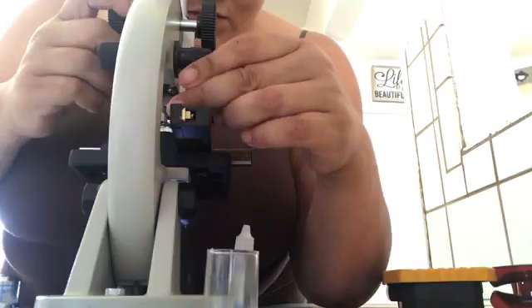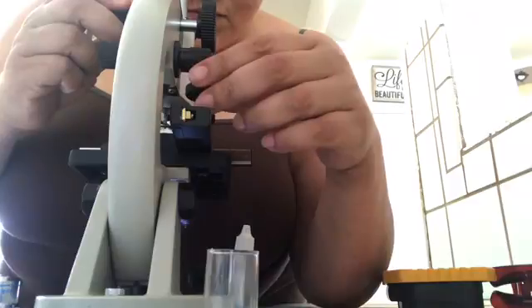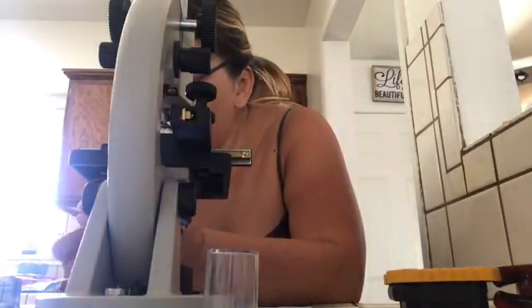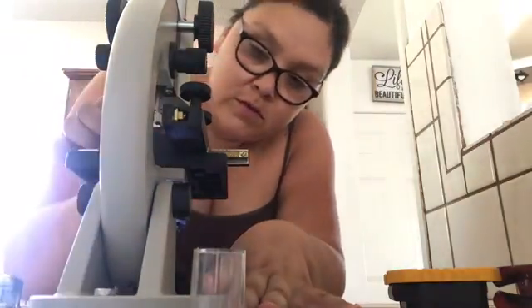So where it goes, nice and focused. Oh, my oil. There's my oil. Now I'm going to turn my revolving nose piece to the oil immersion. That one, this one.